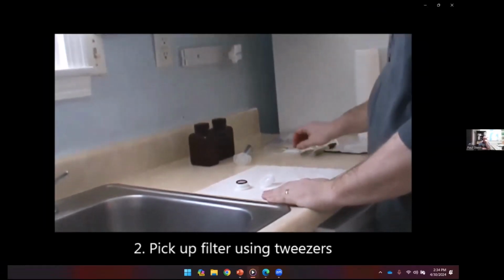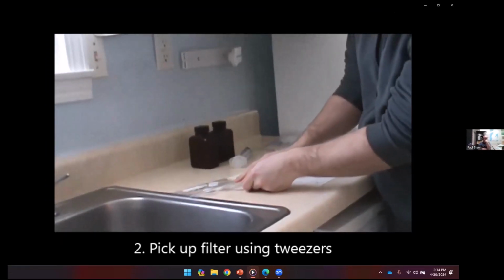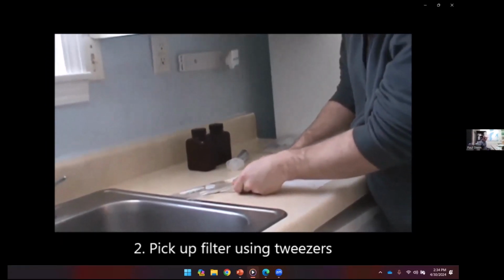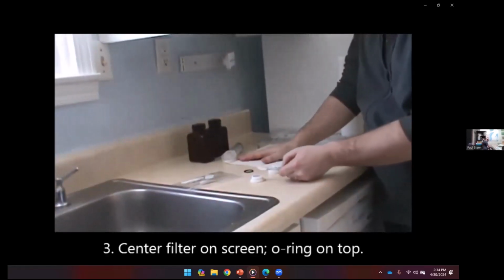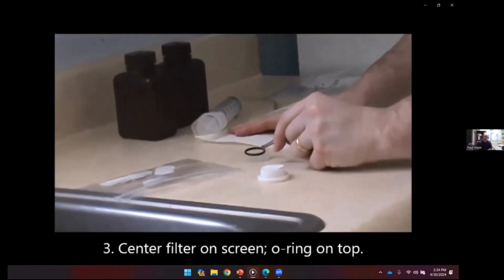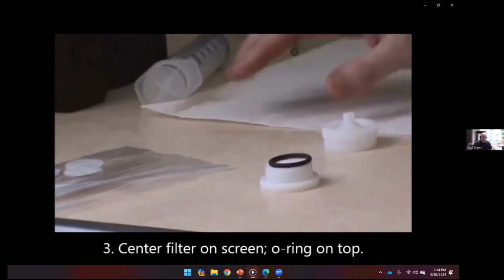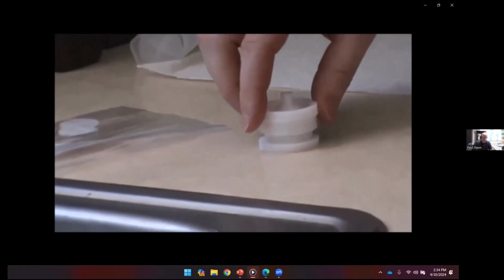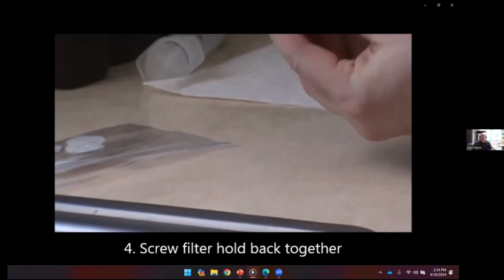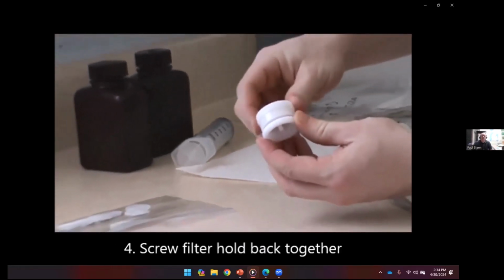The filter is a glossy and opaque white circle. Be sure not to use the filter separators, which are translucent and look more like tissue paper. Center the filter on the screen and place the O-ring on top of the filter. Screw the filter holder back together until it is moderately tight and place it to the side for the moment.